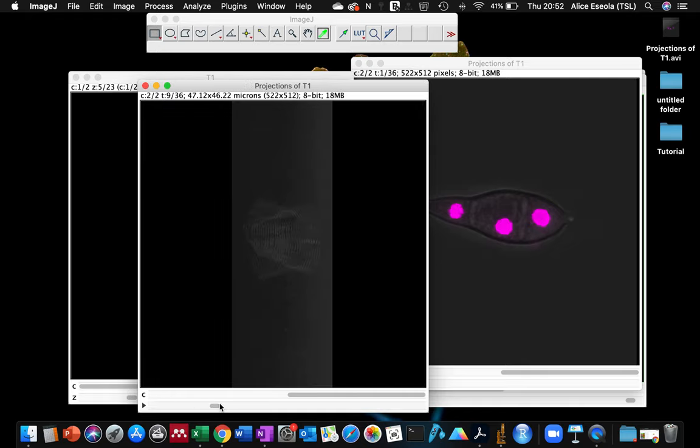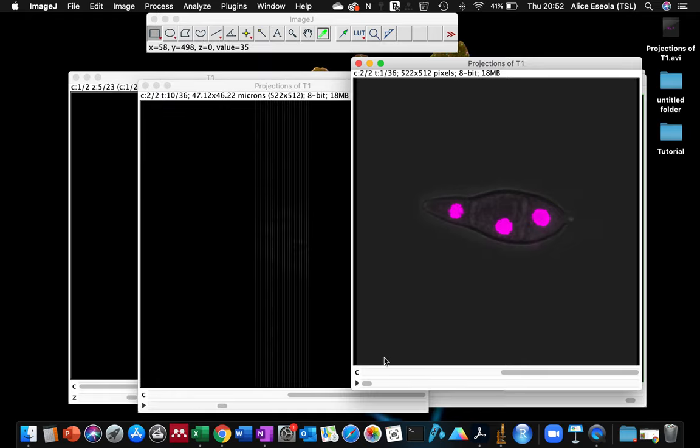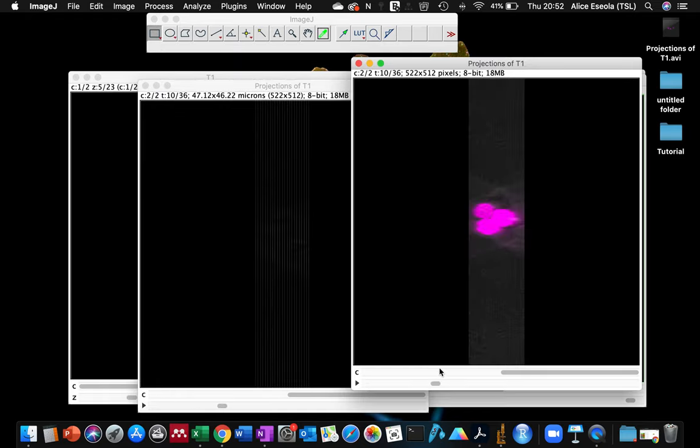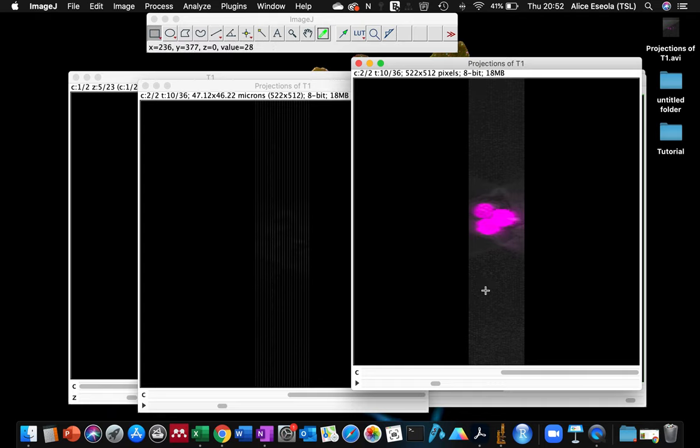I'm going to untick the interpolate option and you will see why you should interpolate your sample. Can you see those lines? When you use the interpolate option, it's smoothing the space in between each slice together. So can you see the difference here?